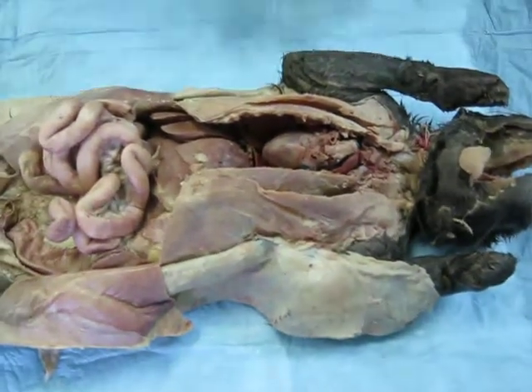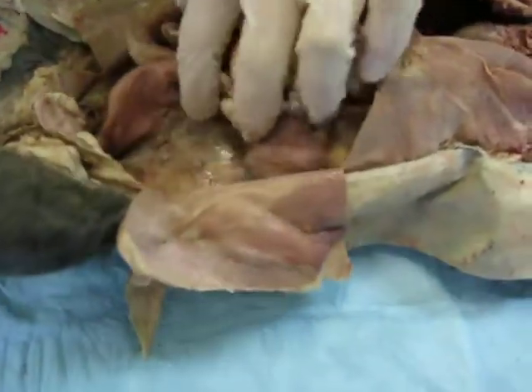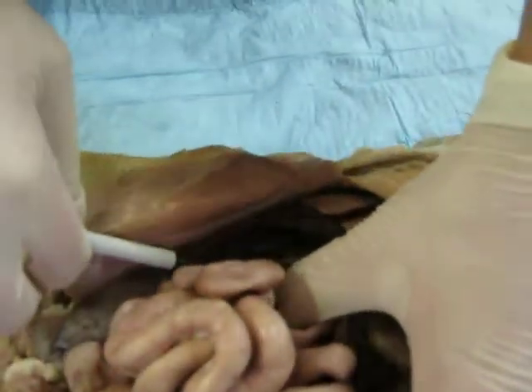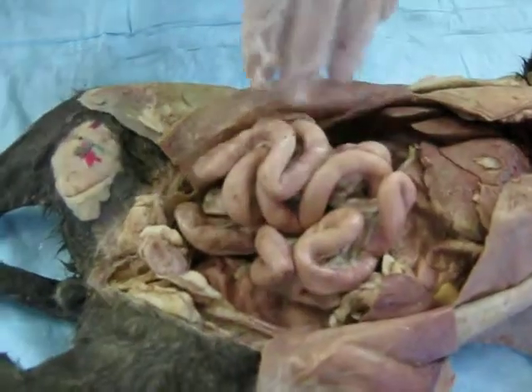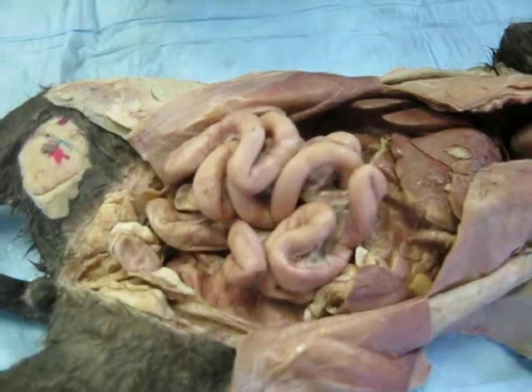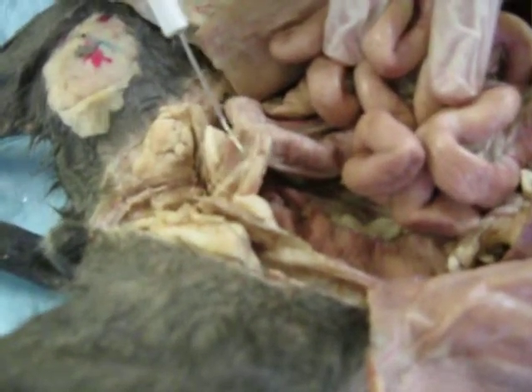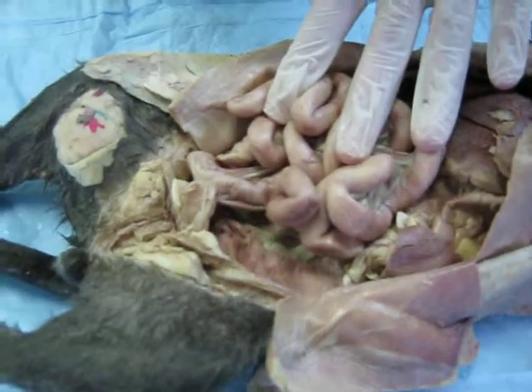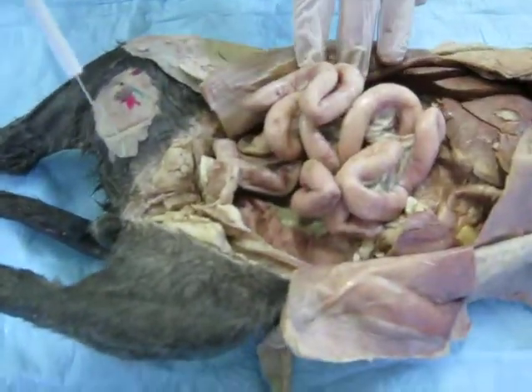We'll now move to the urogenital system. Behind this massive organs here, we have a kidney here and a kidney here. And the kidneys control the regulation of water as it passes through the body, and also helps control water pressure. Moving past the kidneys, we go to the urinary bladder, where urine is stored before it leaves the body during urination. That basically covers the urogenital system, as urine passes out through the penis, which would be in our male cat.